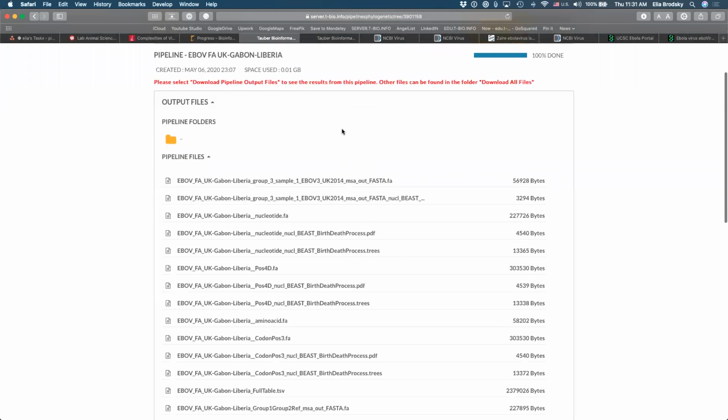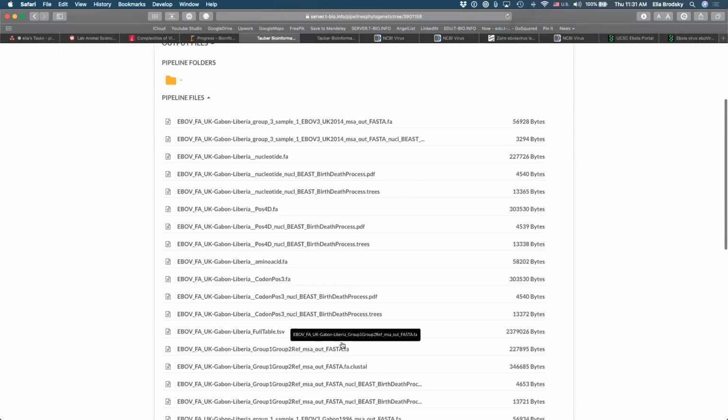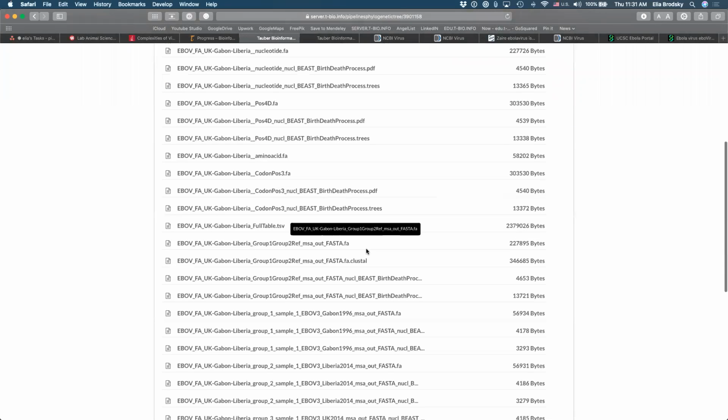Okay, so here we want to look at a number of different outputs, and you can see that as you dig deeper into the details, you will realize how important these different settings are and how insufficient it is to just use straight out of the box tools that you don't know anything about how they work. And sorry, yes, I will take a pause. We don't have that much time.